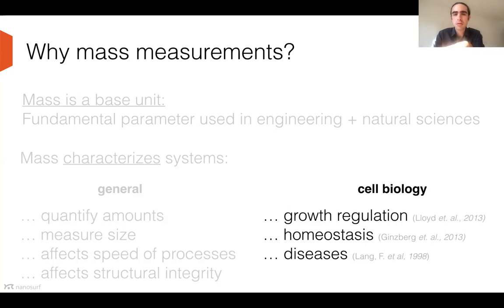With this technology, which I'm going to present to you, you can actually measure quite accurately, to less than 1% of the cell mass, how the mass of the cell is changing, and that is how the cell is growing, for instance. And at the same time, you have an environment for the cell which is like a cell incubator, a physiological environment. So the cells just keep on growing. They don't notice that they are being measured.